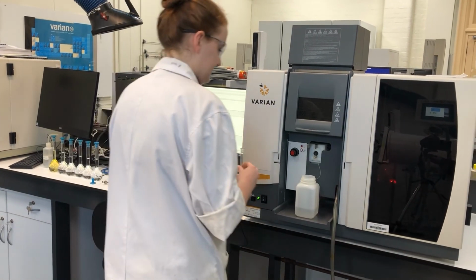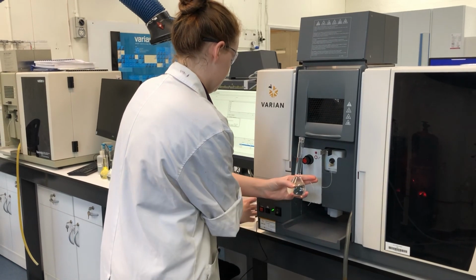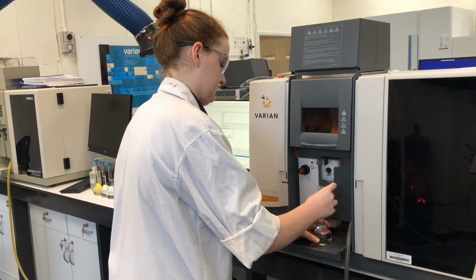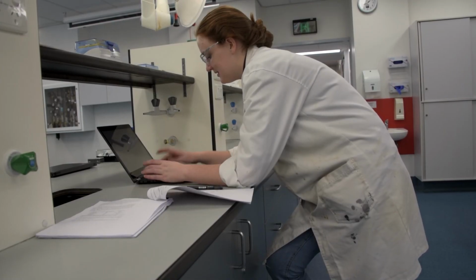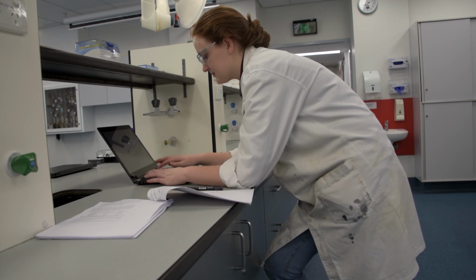In this practical, each standard was run on the instrument from the most dilute to the most concentrated. Before each sample was run, the analyst shook the sample to ensure adequate mixing. Once the standards were run, the sample was then analyzed. The absorption of the standards was plotted with QT calib to ensure the QC of the regression was below 5%.